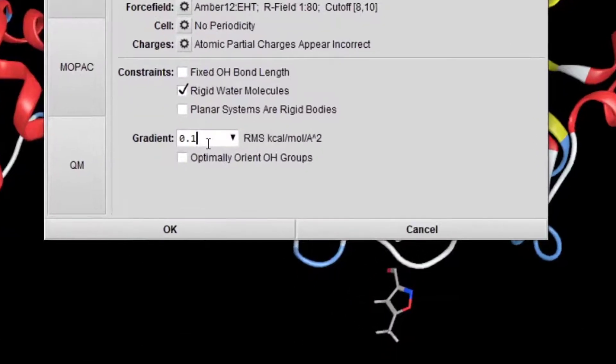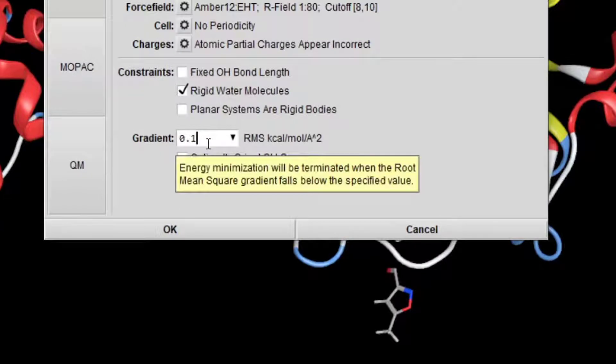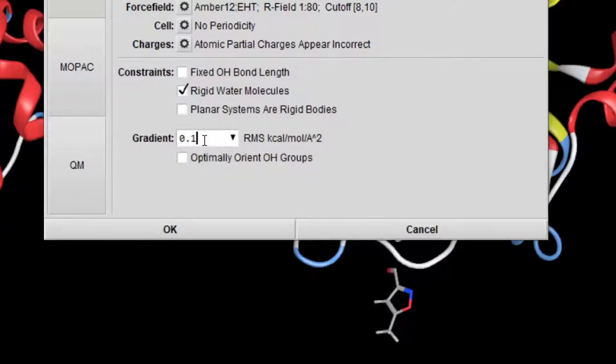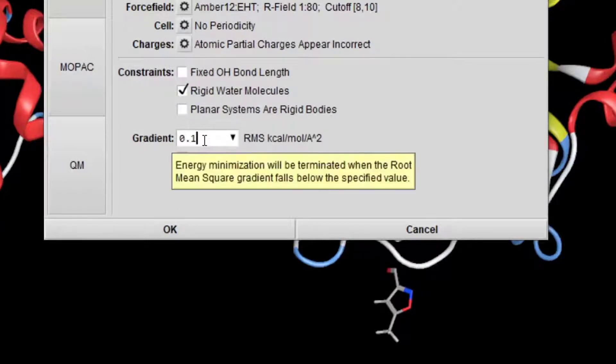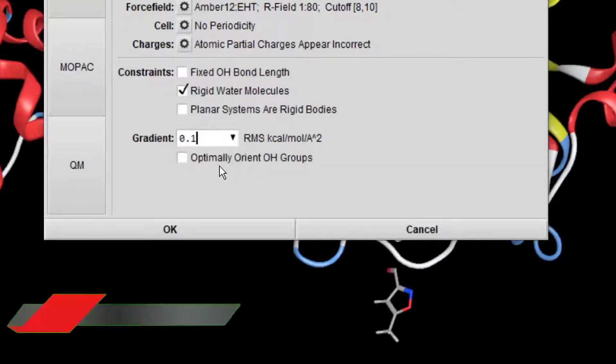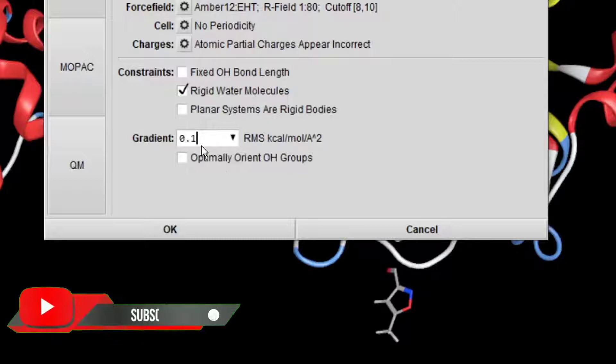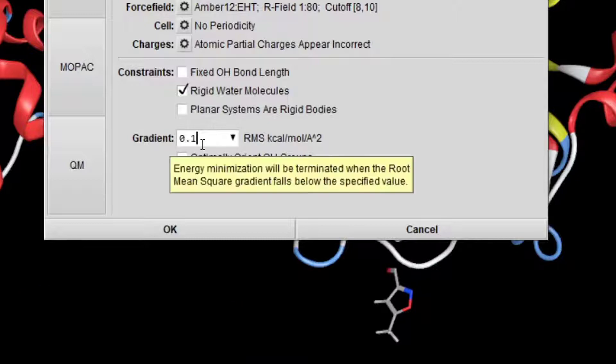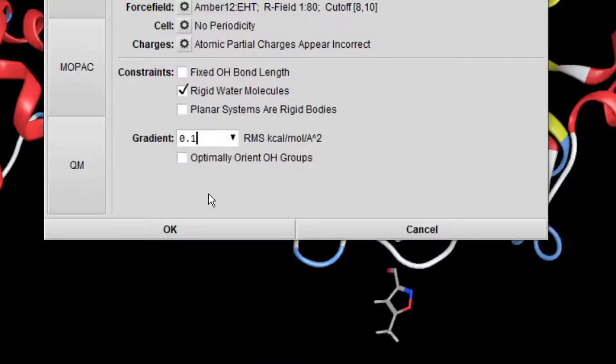Here you give the value for how much you want to minimize the structure. So leave it by default and click OK.